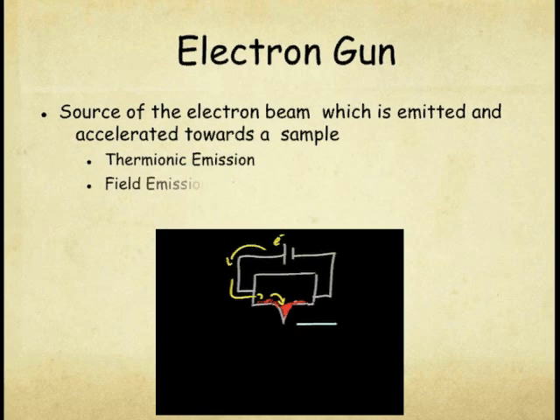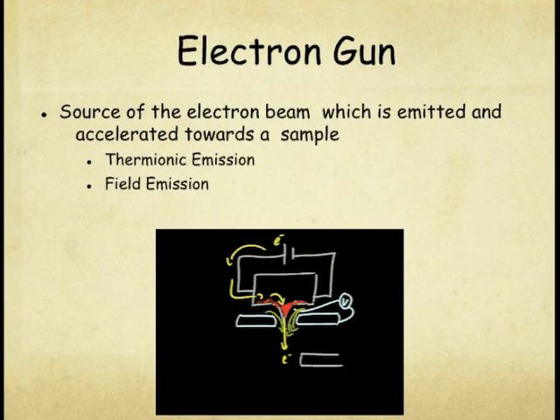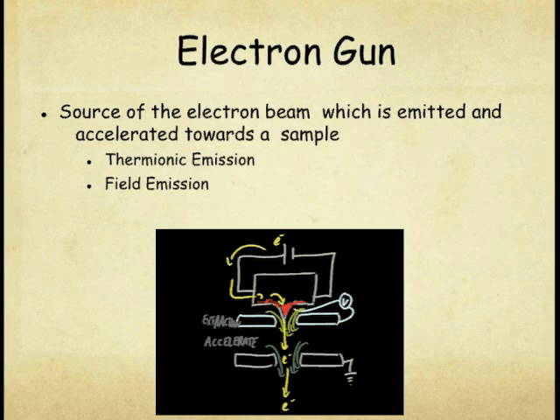A field emission gun operates by having a potential difference or extraction voltage established between the tip and the first anode. The resulting electric field, concentrated at the tip, facilitates electron emission, and a second, grounded anode establishes a potential difference to determine the accelerating voltage of the gun.